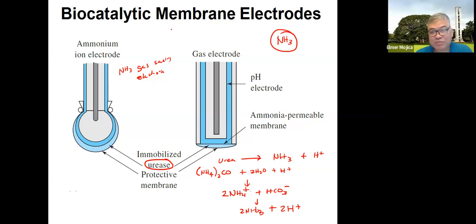So usually sometimes they just stick it in this membrane. Sometimes they put a protective membrane. Some use the sol gel method. But the problem with the sol gel method is that the material you have there could affect the activity of the enzyme. Cross-linking, okay, in ways that the reagent you use will not affect the activity of the enzyme is another good way of immobilizing them.